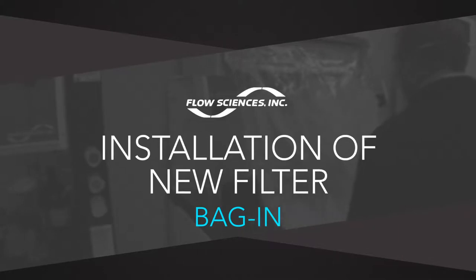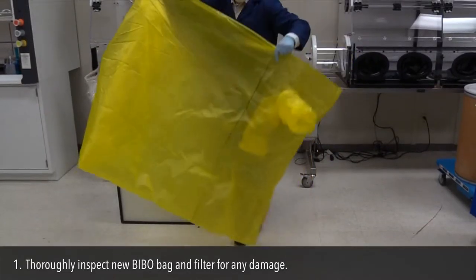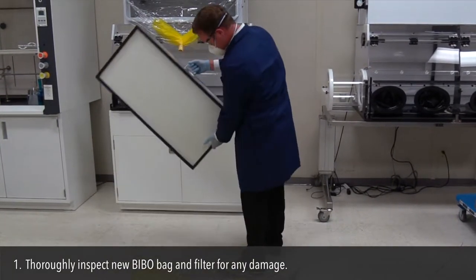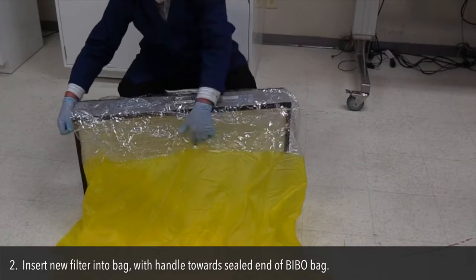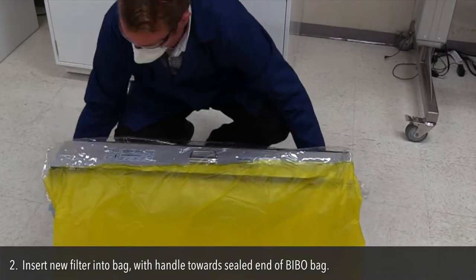Installation of new filter — Bag In. Step 1: Thoroughly inspect the new BIBO bag and filter for any damage. Step 2: Insert new filter into bag with handle towards the sealed end of the BIBO bag.